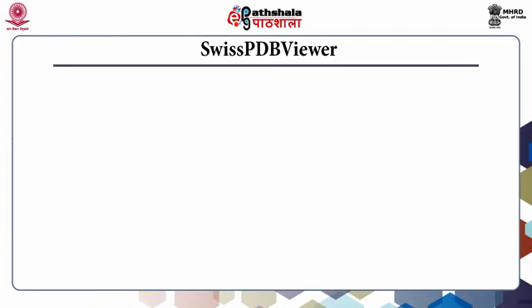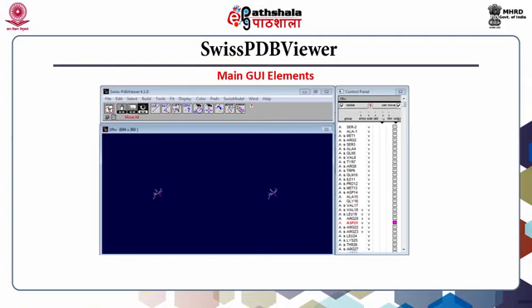The 3 main graphic user interface elements are displayed now. Adjust these GUI elements by clicking in the title bar and dragging the window to position them as shown in the slide for the main window, graphic display window and control panel window.